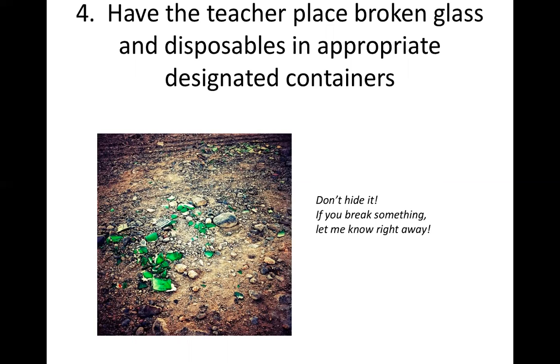So in case an accident happens, and it really happens, every year we have accidents where glasswares are broken, so it's not intentional. So it's okay if you broke a glassware. You just have to tell the teacher so that the teacher can assist you in cleanup and where it should be placed after the cleanup.